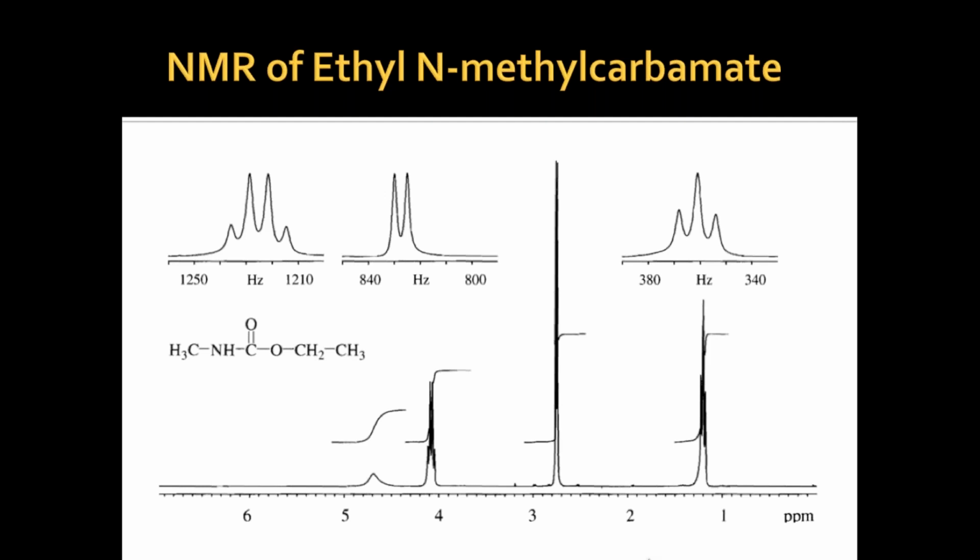Let's see the example of ethyl methyl carbamate. Carbamate is NHCO2. So the point here is: where are the peaks?